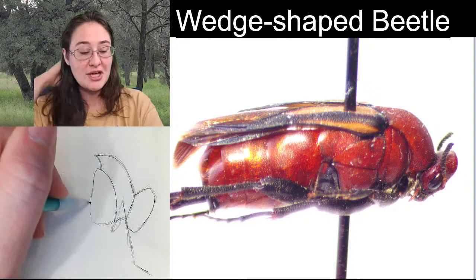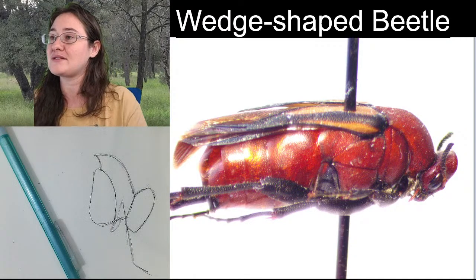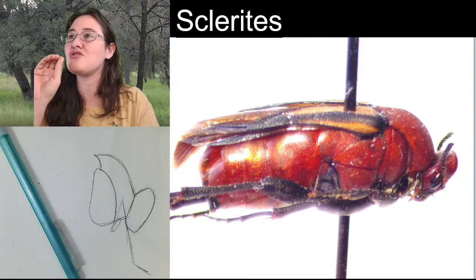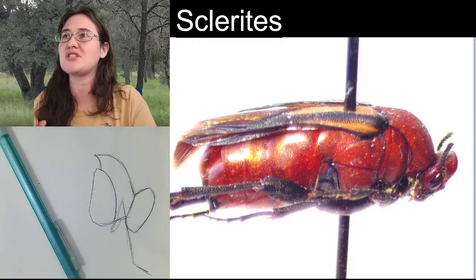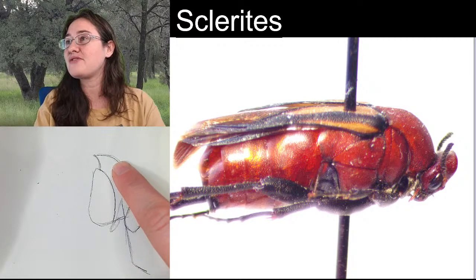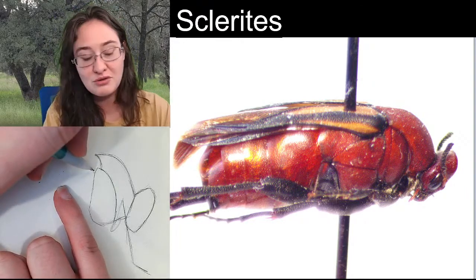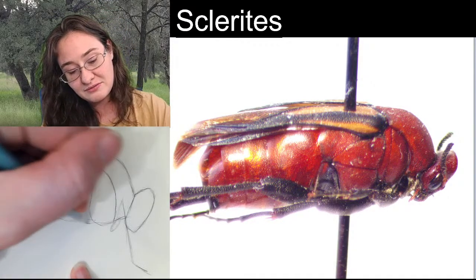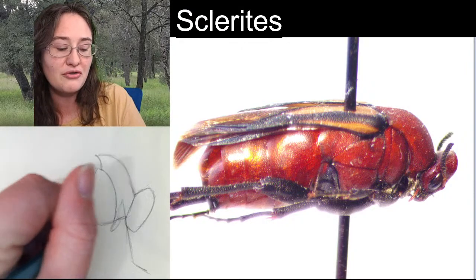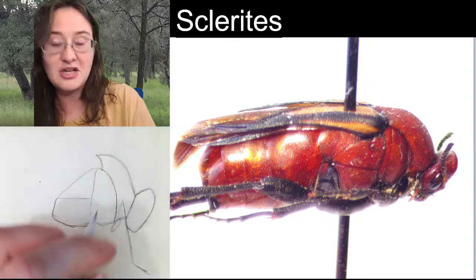And then, when I'm looking at the lateral point of view of our beetle here, I'm trying to look at what we call sclerites. These are the pieces of the exoskeleton. You can see that there are lines in between them. Those are the divisions of the plates. So I guess you could call the sclerites exoskeleton plates. And so you've got this first one, the pronotum. You've got the mesonotum, which is the second segment of the thorax. And the third segment looks like it's almost divided in two. If you wanted to, you could take it down in this way, and then your top piece is going to be broken into a triangle, whereas the bottom piece is going to be more rectangular. And we'll probably be modifying that shape a little bit as we go through. But that is going to be our overall shape.